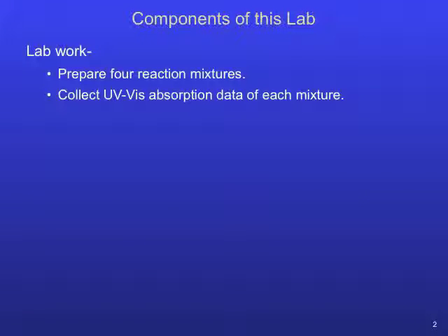A total of 4 reaction mixtures are prepared, with all 4 reactions started at the same time. Your lab measurements will involve recording UV-Vis absorbance data of the cobalt complex in the reaction, which is one of the 2 reactants in this experiment.